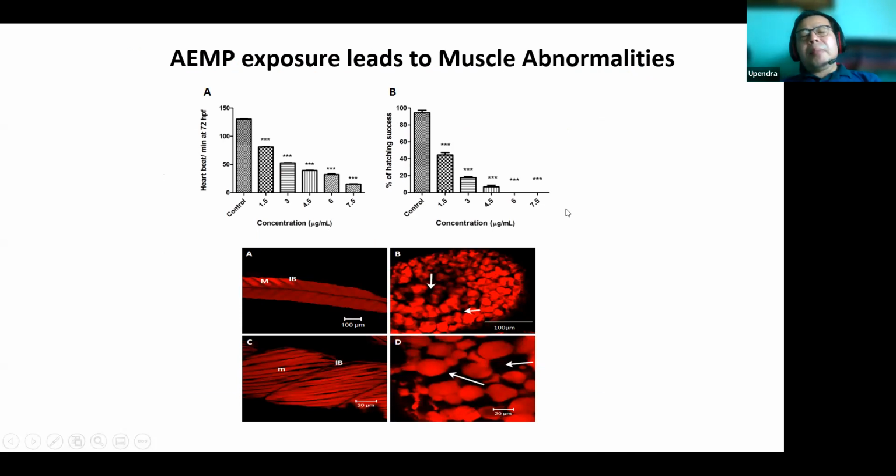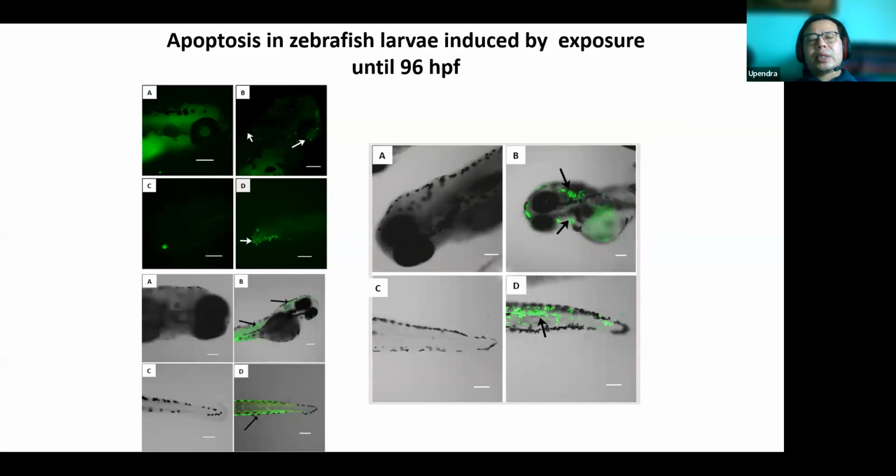So we have many drugs which we treat with, and the muscles or the tissues become abnormal, neurons become abnormal. All these, when the induction happens, this is what we want to look at by live imaging. When do the cells die, right? That is what we would like to look at. And we are now collaborating extensively with Akash Guliani. Akash is the person who makes this visible dye, right? And that dye is not toxic to the organism.